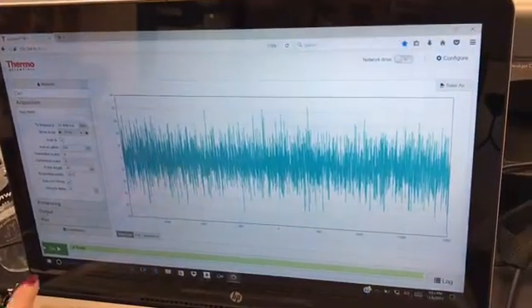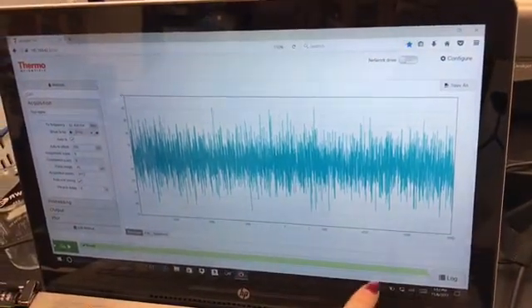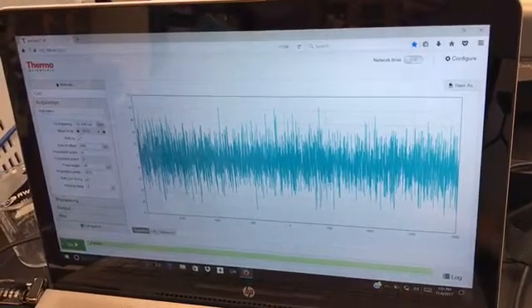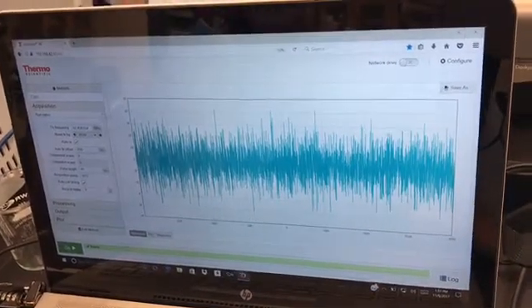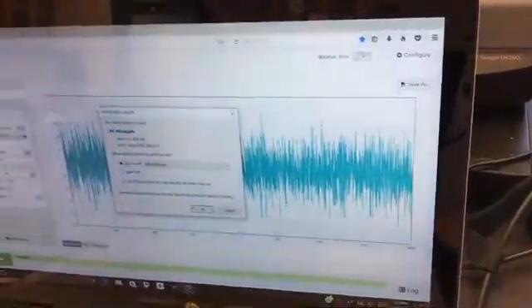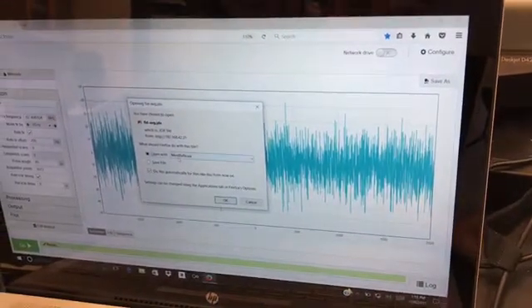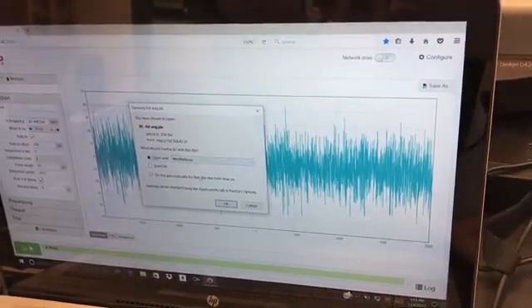Now that your run is complete, you should see this green bar down here that says Ready. Now, you can go up here, to the top right, click Save As, and it should already say Open with MESS Renova, click OK.